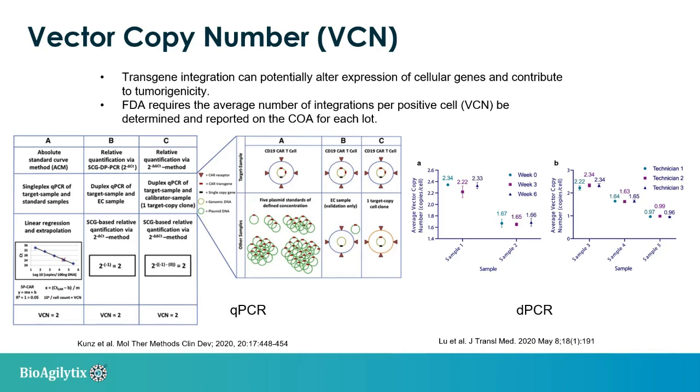However, as Amanda just mentioned, that PCR quantification is based on a standard curve, so the results are directly impacted by the theoretical copy number determination of the standard material and also the preparation of the standard curve, which could cause high variation of VCN determination. Because of this disadvantage, some people started to try to avoid the use of a standard curve, but use the delta-delta CT method instead for VCN assessment.